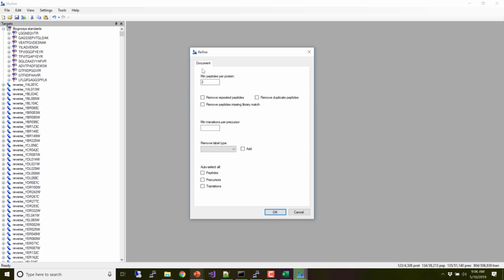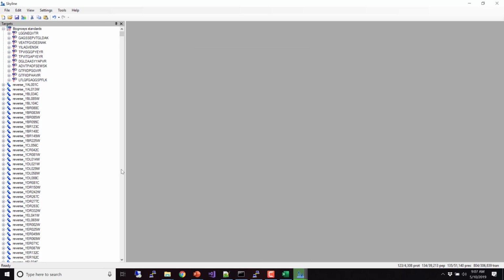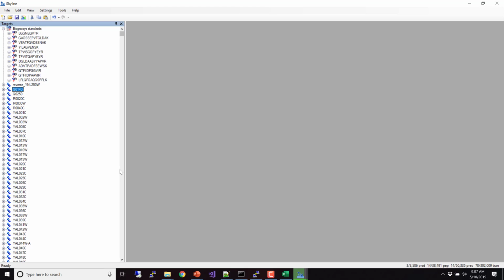We're going to require 2 peptides per protein, which, in another experiment, I found to be really useful, because then you have to have at least two peptides kind of in agreement that the protein is changing. Otherwise, you're really trusting this one peptide to speak for the protein, and little things can make you go wrong. So statistically, this is a safer bet, but we also lose another 500 proteins.